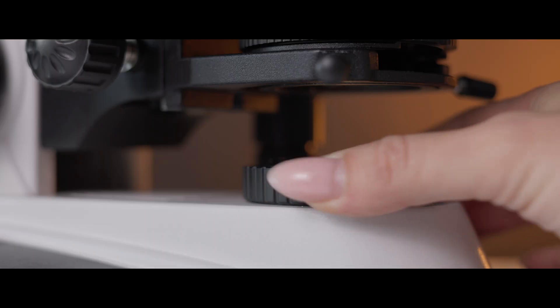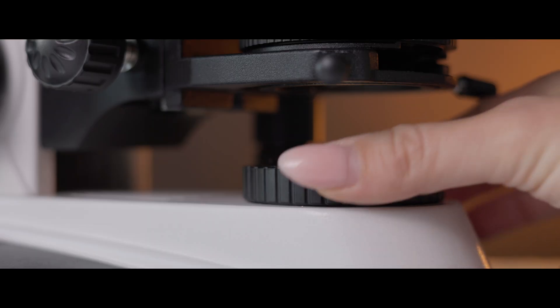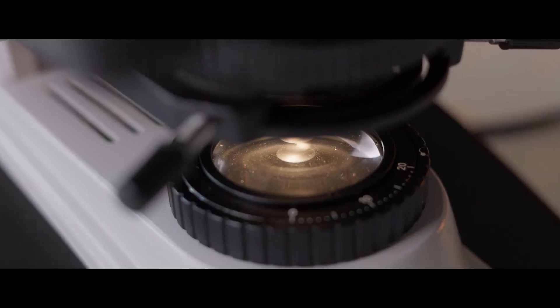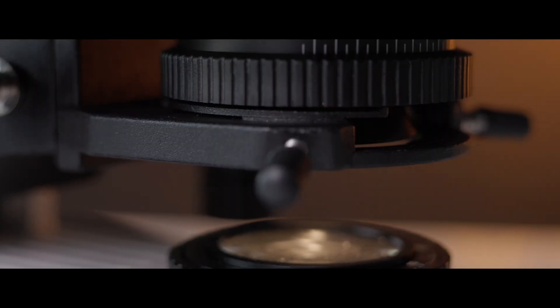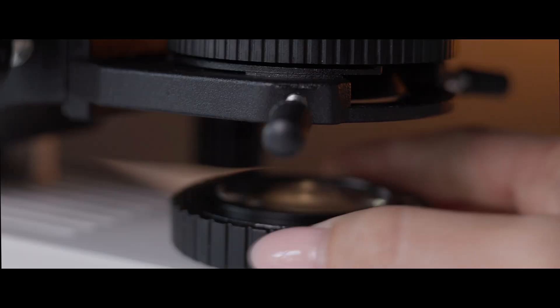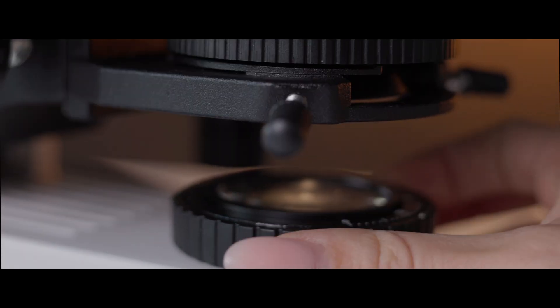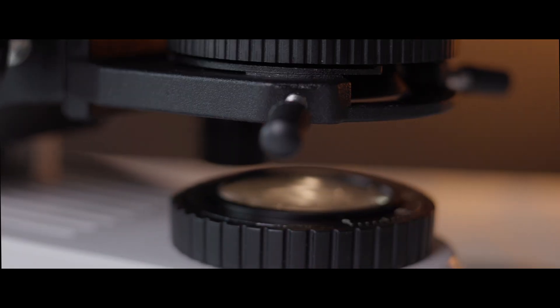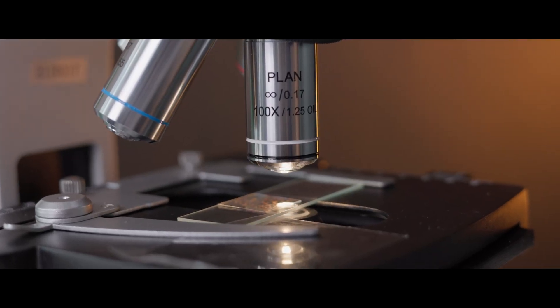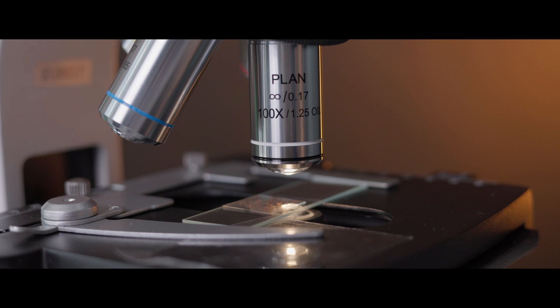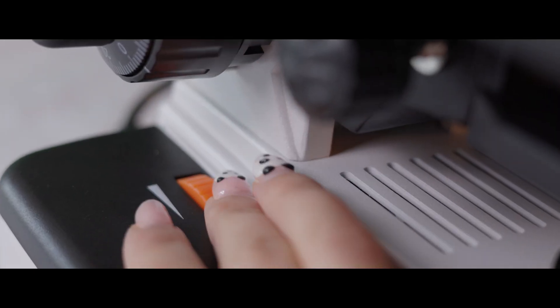When it comes to illumination, the OM139 really shines—literally. You've got a variable intensity tungsten halogen lamp, and the Koehler condenser makes sure every sample is lit perfectly. The 1.25NA Abbe condenser with an iris diaphragm and filter holder gives you total control over how you light your specimens, making everything super crisp and clear.